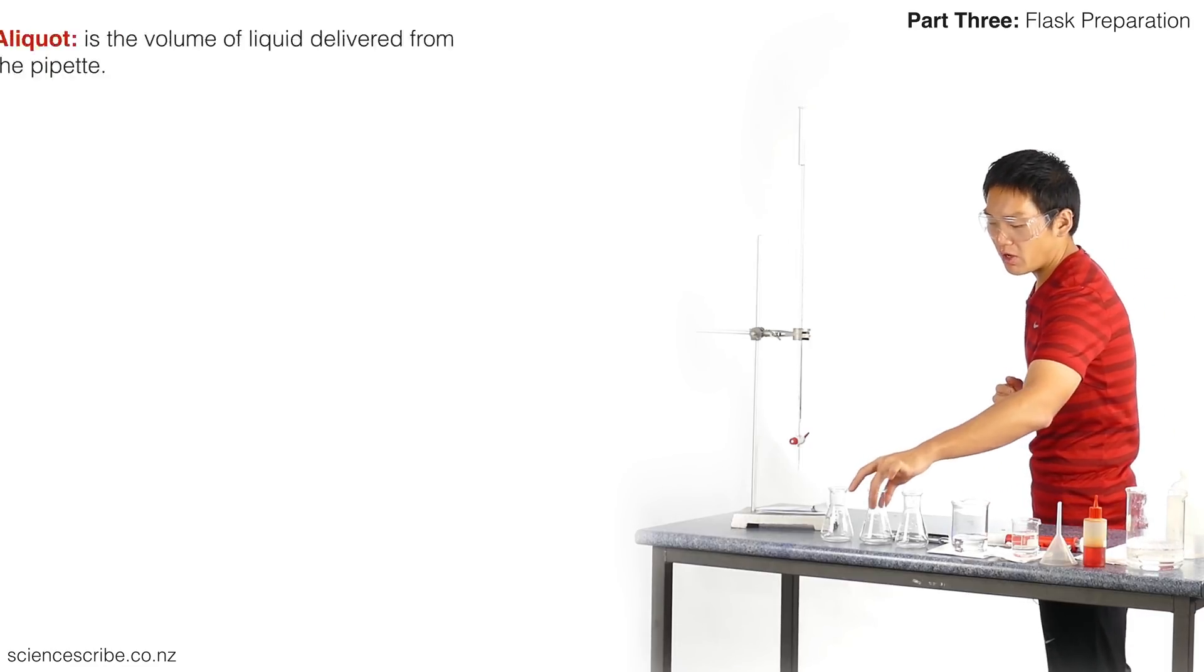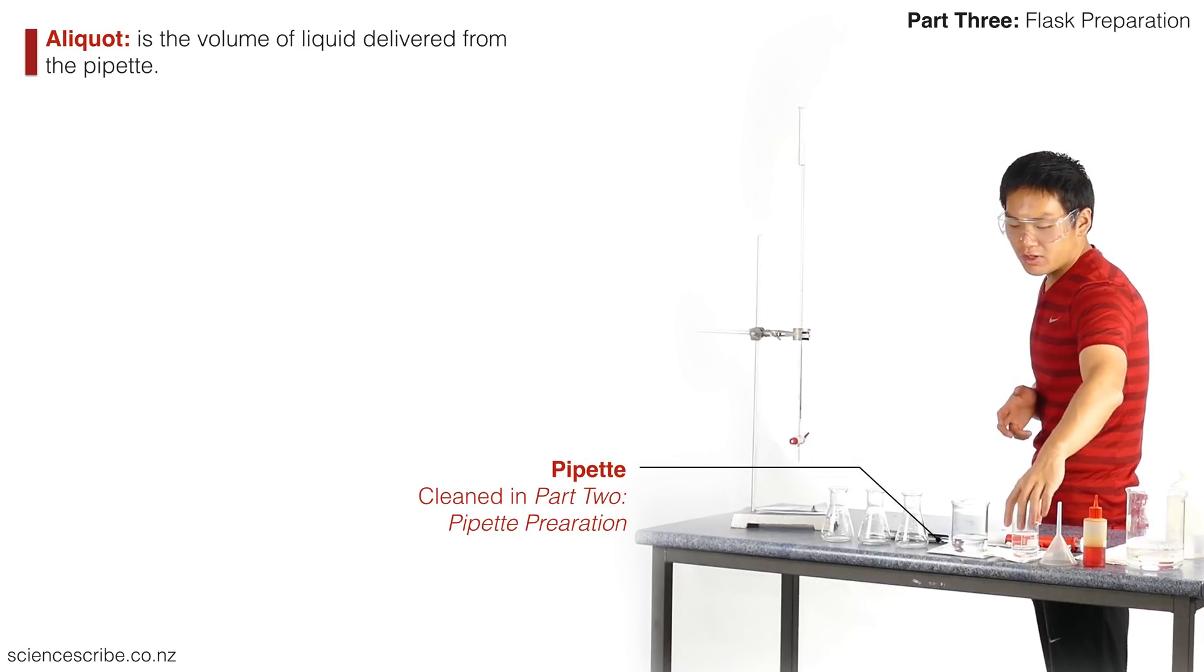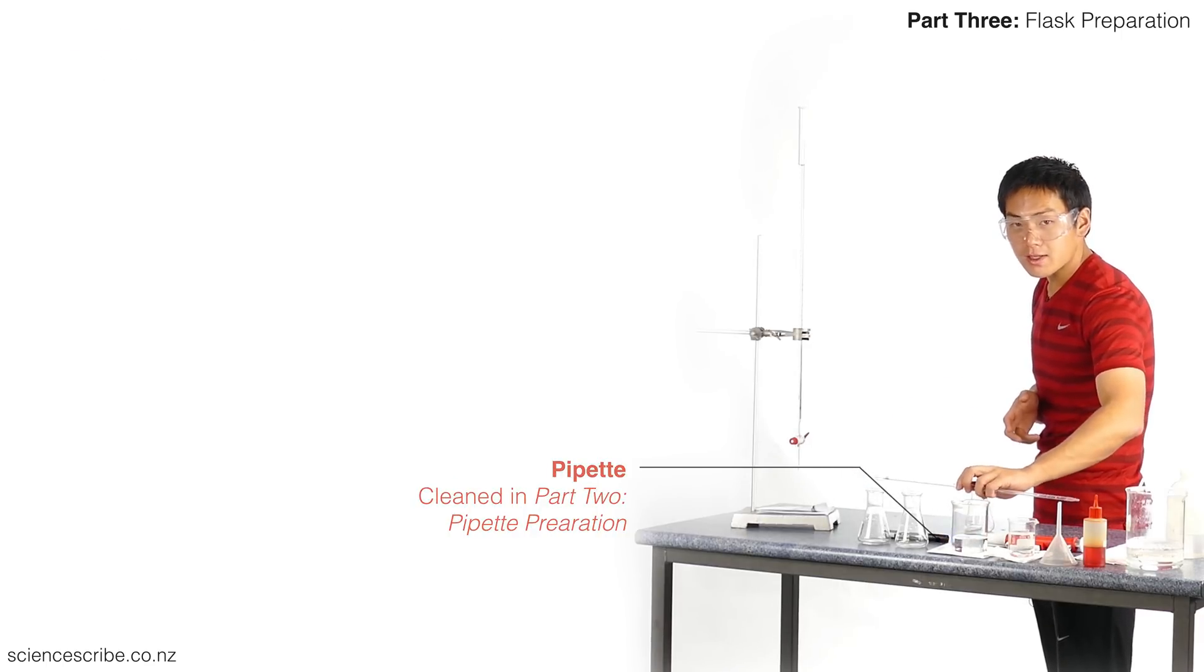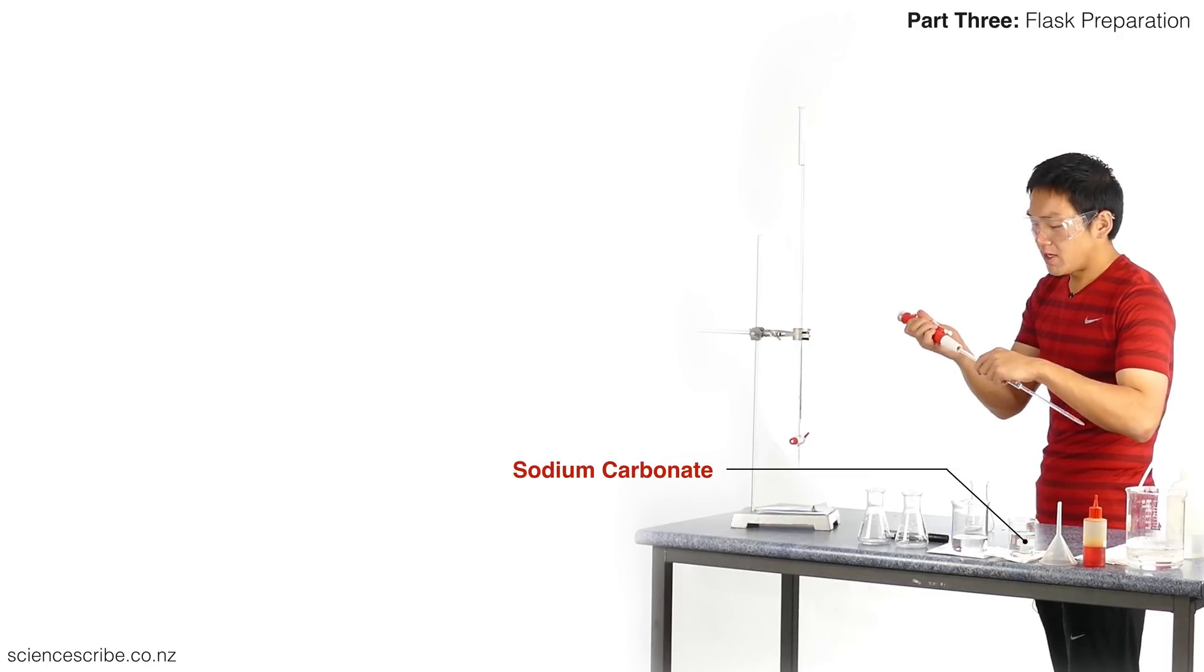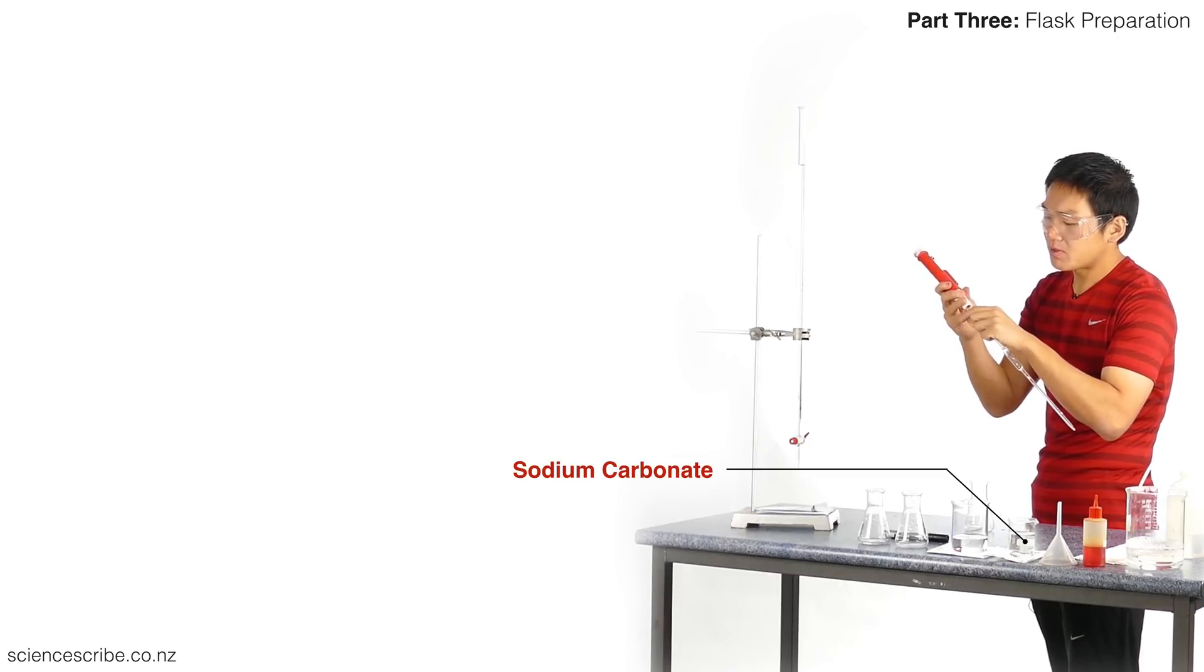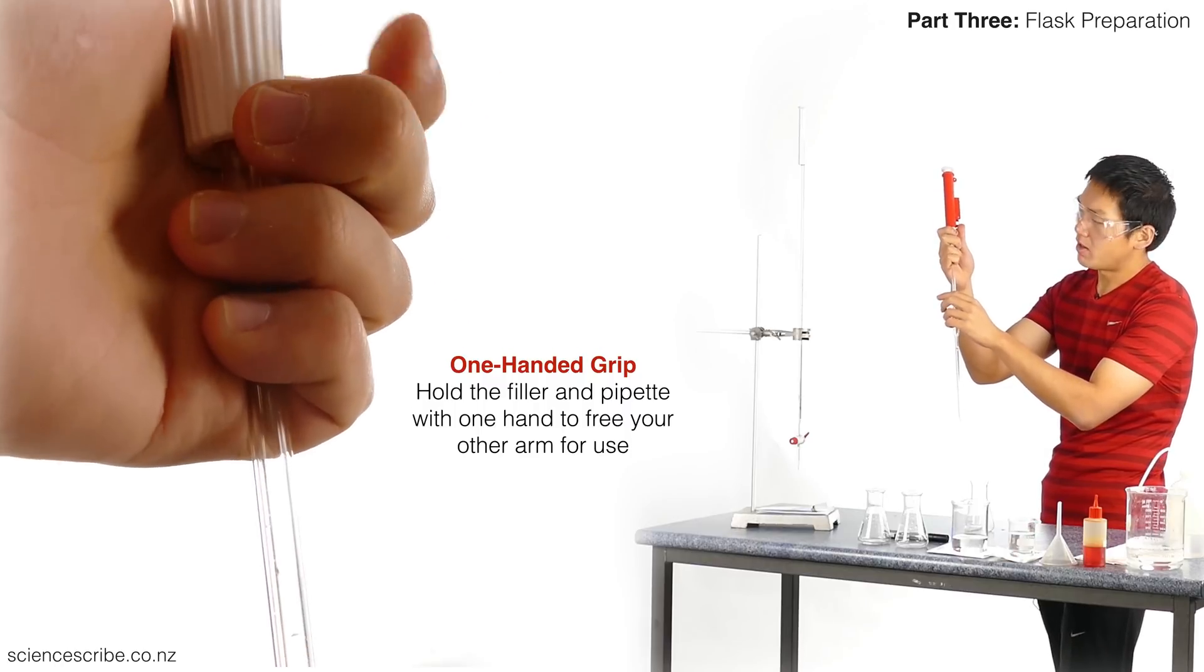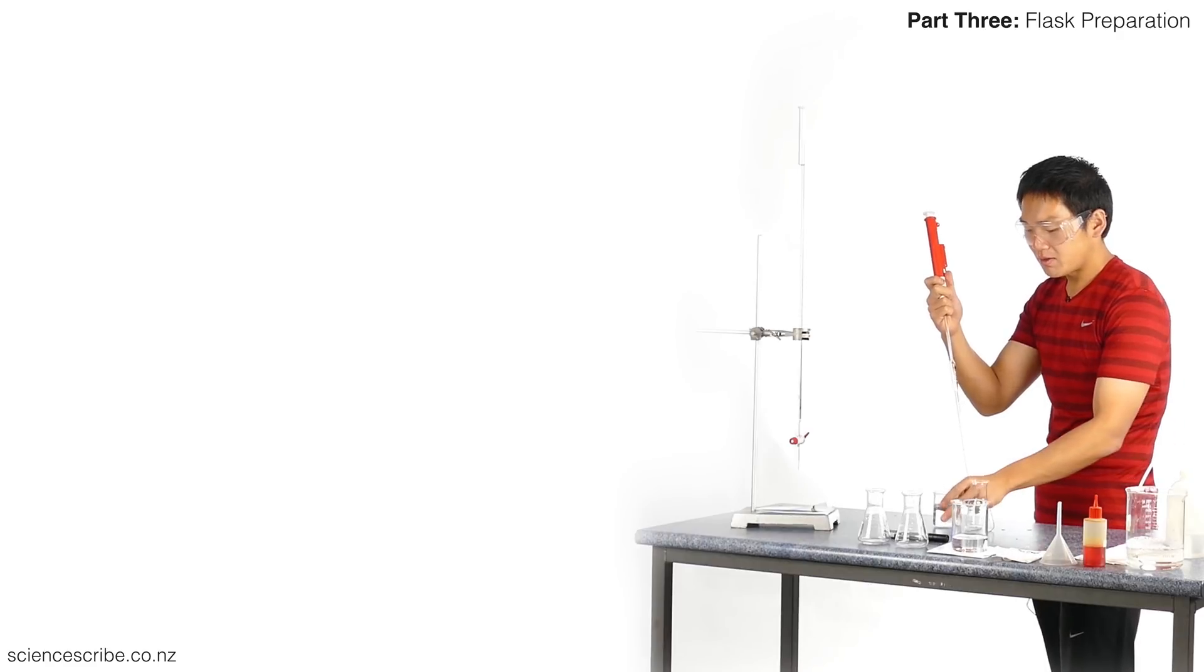Now to prepare my flasks ready for a titration, I'm going to grab aliquots using my pipette. In this case I'm actually trying to determine the concentration of my sodium carbonate, so that's going to go inside my conical flask. I'm going to prepare two conical flasks at the start. To get my 10 mils from my pipette, I'm just going to place my pipette filler over the top gently. I'm going to hold the pipette and the pipette filler with one hand, but notice where my fingers and thumb are—I'm actually gripping both of those together.